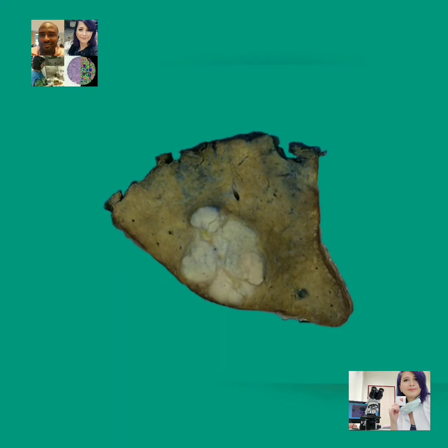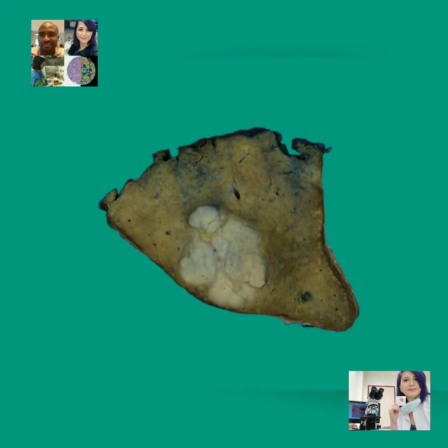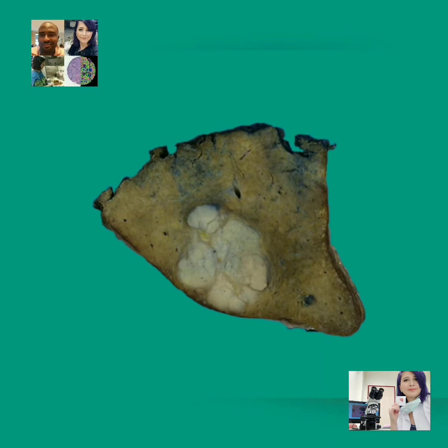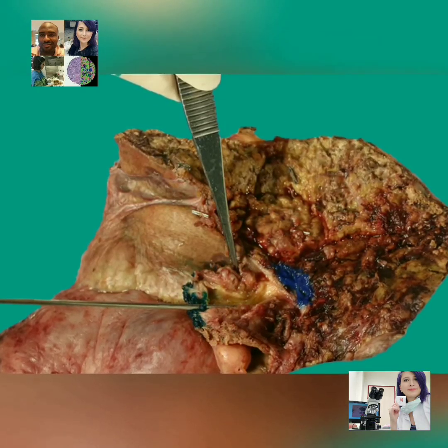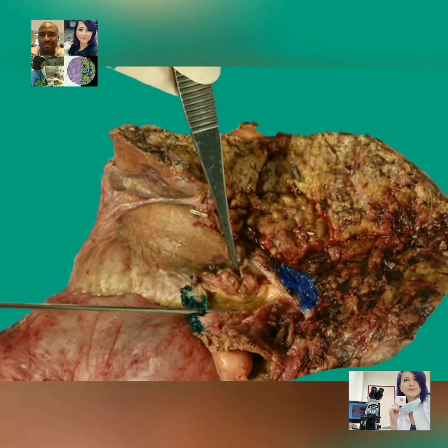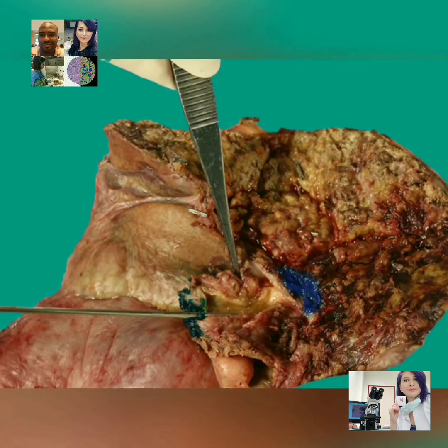The dimensions of the sample should also be taken in 3 dimensions, i.e. anterior-posterior, mediolateral, and superior-inferior, or simply stated length, breadth, and width. All anatomical components present should always be described. For example, if the gallbladder is present, it should be documented along with its dimensions. Gallbladders have a separate, specific protocol for grossing, which will be discussed in another series.